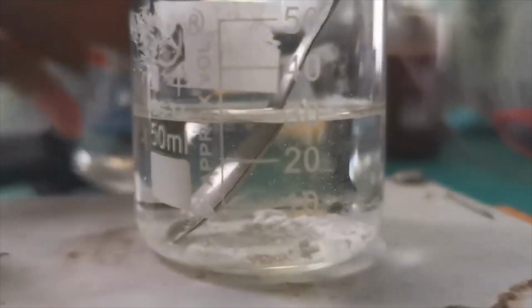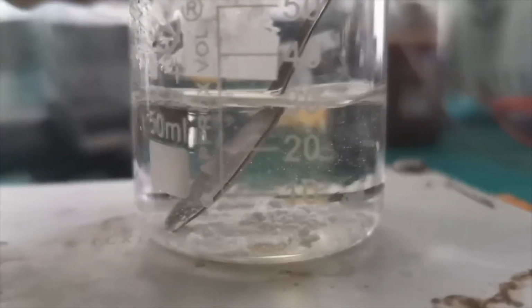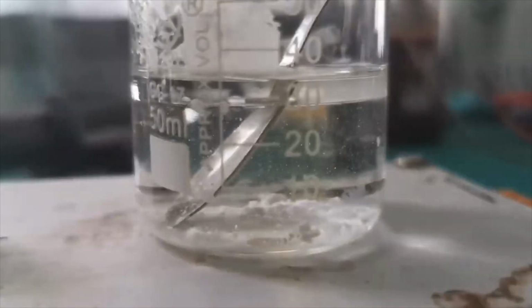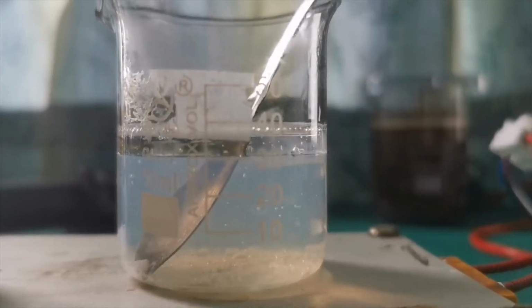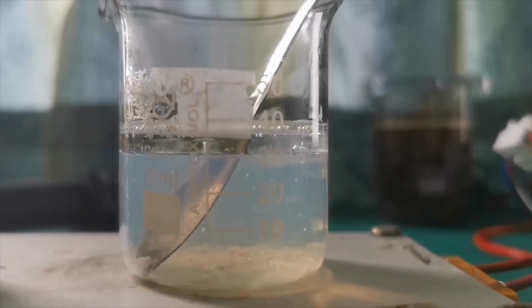The beaker is placed on the hot plate again, and around 5 milliliters of paraffin oil is poured on top of the PC, which isolates it from atmospheric moisture and oxygen. Lithium chloride is only sparingly soluble in PC, and heating it up helps improve the dissolution. When the beaker starts to release fumes, it is removed from heat.